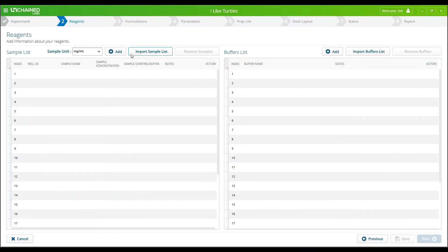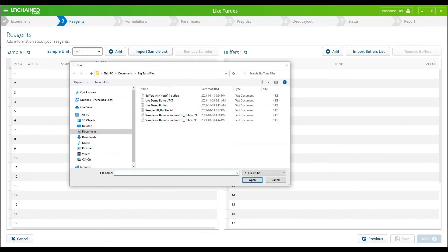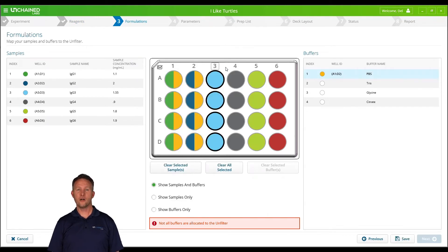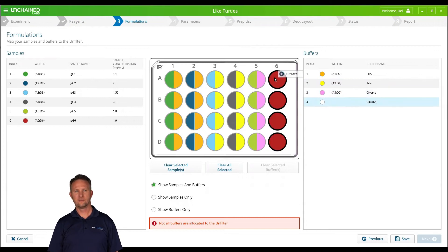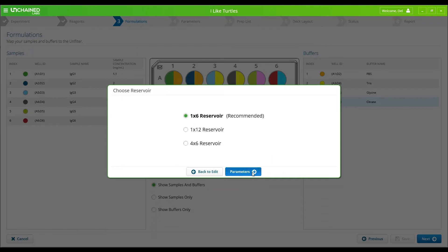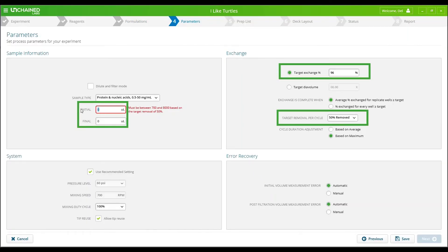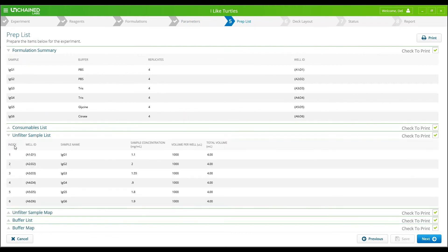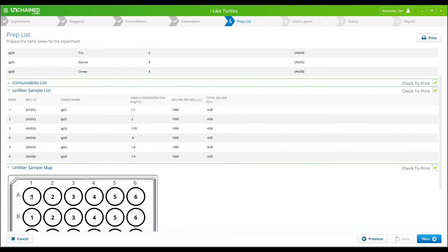You can input your samples manually or directly import them from somewhere else with just a few clicks. Then drag and drop your samples to where they will be on the Unfilter and indicate final buffers. Here you can see all of the process control options that allow Big Tuna to baby your precious samples. Easily program key buffer exchange parameters, and you're shown exactly how to set up your samples in the Unfilter so that there's no guessing.